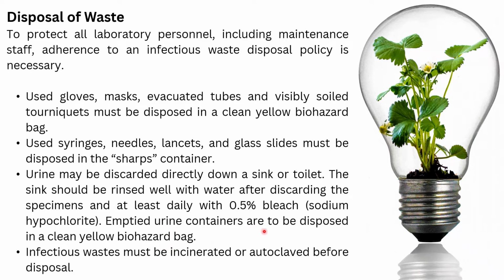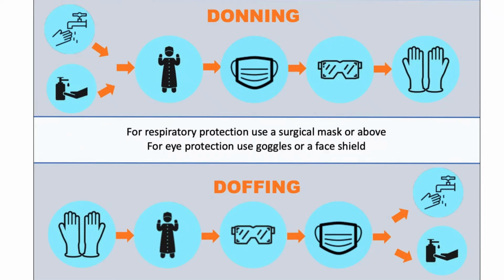Emptied urine containers are to be disposed again in the yellow biohazard bag. The other infectious waste must be incinerated or autoclaved before we dispose of it. In this slide here, class, these are the recommended steps for putting on and taking off the personal protective equipment.